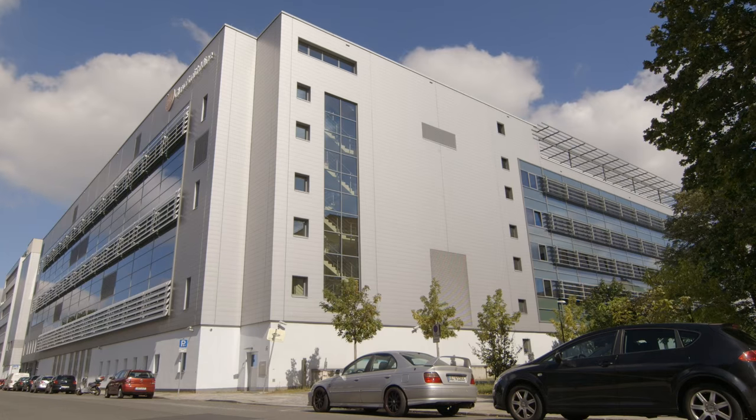We are manufacturing here on this site influenza vaccines, seasonal and pandemic influenza vaccine.